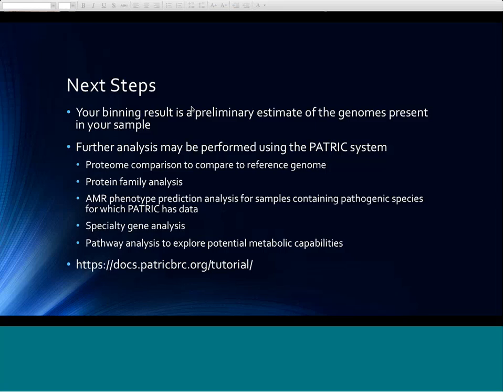We work on strains of the same species. How confident is PATRIC on strain level? Not sure if I quite understand that question. I'm going to assume that means that if you have a sample with a number of very close strains in it, will the binning service be able to separate those strains? Let Ross or Bruce correct me if I'm wrong.